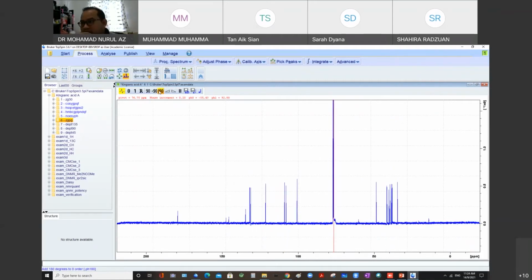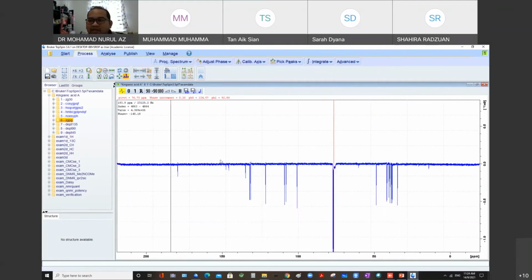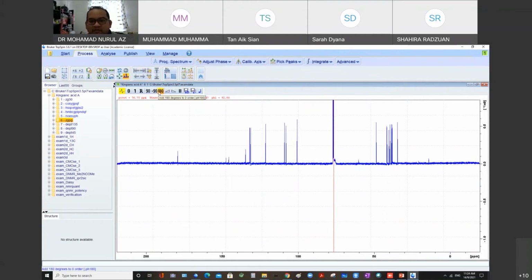For example, I don't want to be like this. The positive mode is typical, it's not new. I want to process the data with the negative mode. So go ahead, you can do it like this, but you will get a headache. So it's better to put it like this.